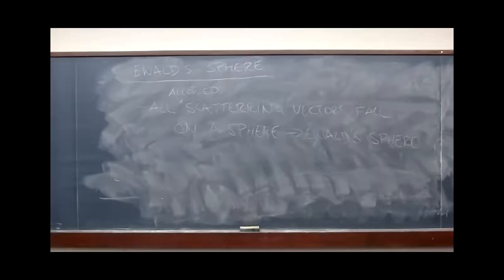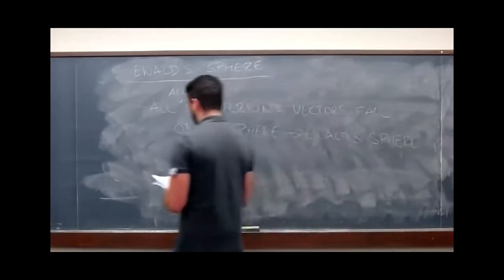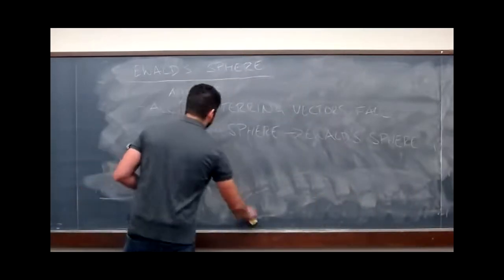So we're almost done for today. The last bit I want to talk about today is rotating crystal diffraction experiments.